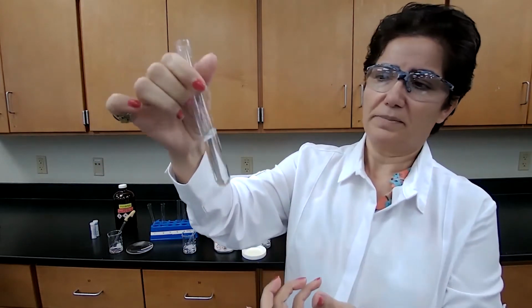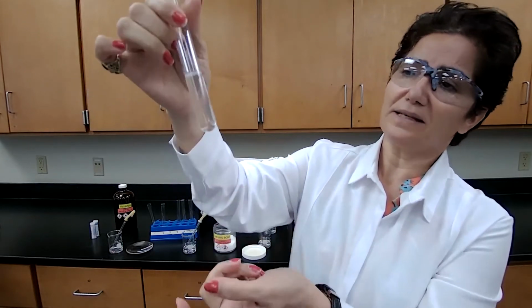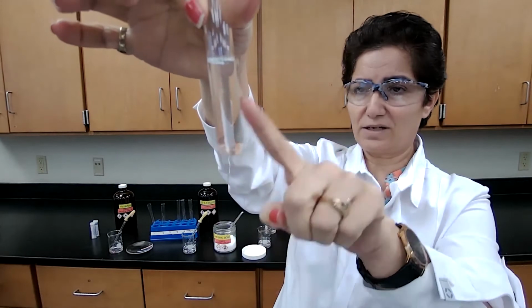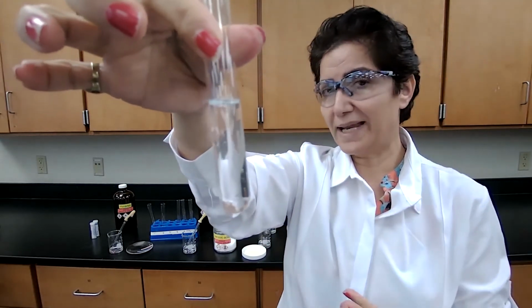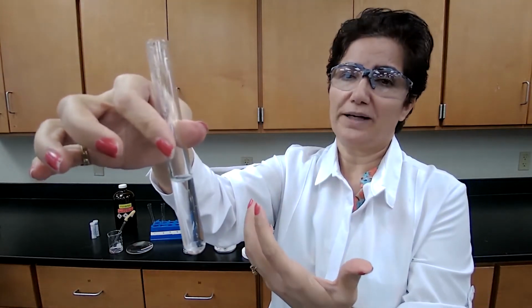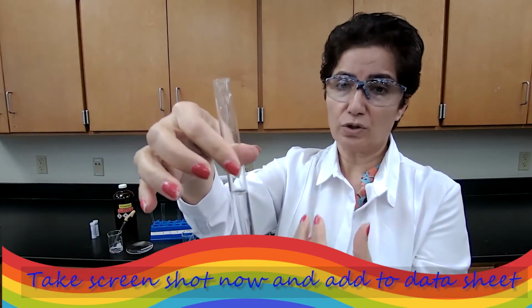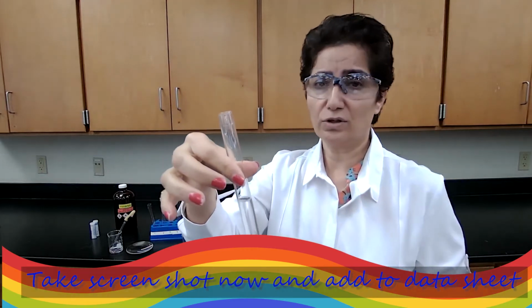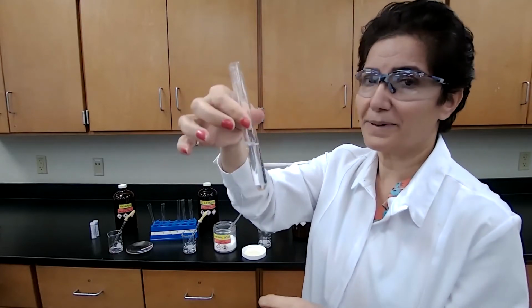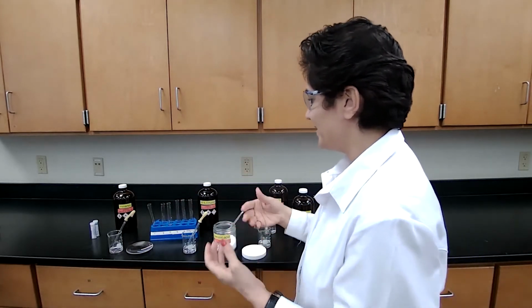Okay, because it's a solid compound and it takes time, you have to shake it vigorously. It is disappearing, and the final result here is that this compound dissolved because it's an organic acid. It dissolved in sodium hydroxide. Basically, it reacts with sodium hydroxide and generates a benzoate salt, sodium benzoate, and any compound that contains sodium is soluble in aqueous solution. So the product dissolved in the sodium hydroxide. It reacted and then it dissolved.